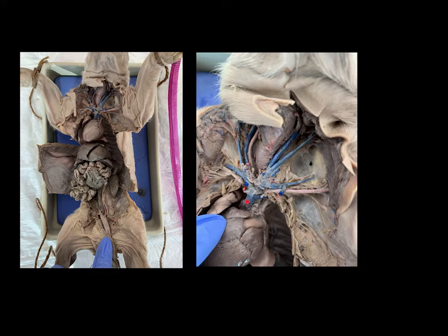This vein right here, this is the superior vena cava. A lot happens really, really quickly when we're entering the heart, but for purposes of just explaining this, just above the heart, where this vessel's leaving the heart, this is the superior vena cava. It's very, very short in the fetal pig. Immediately above it, right where everything merges, this is the brachiocephalic vein.